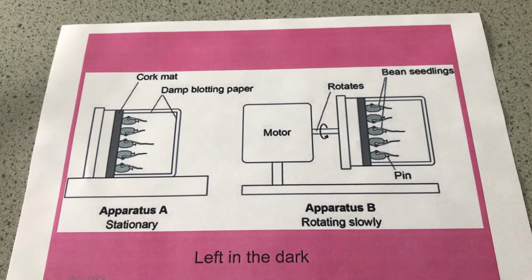Be careful with what the aim of the experiment is. What is the independent variable? Write your methods so that it matches what your independent variable is. We've seen some results. We've looked at anomalies. We've talked about precision. We've talked about reliability. So let's just look at those words again quickly. Precision. We're measuring to the nearest millimetre, which is more precise than measuring to the nearest centimetre. We talked about that being high resolution. We're doing 10 repeats to improve the reliability of our results.